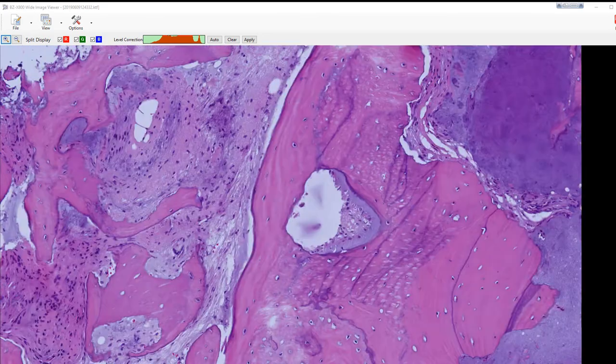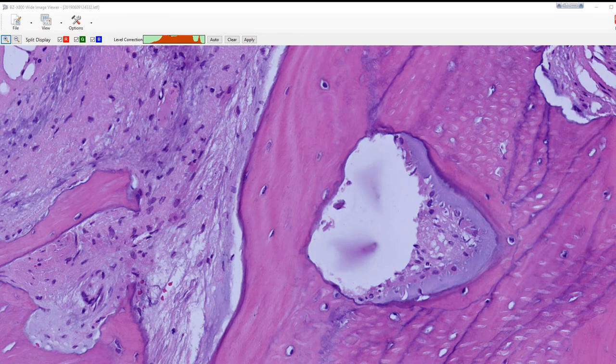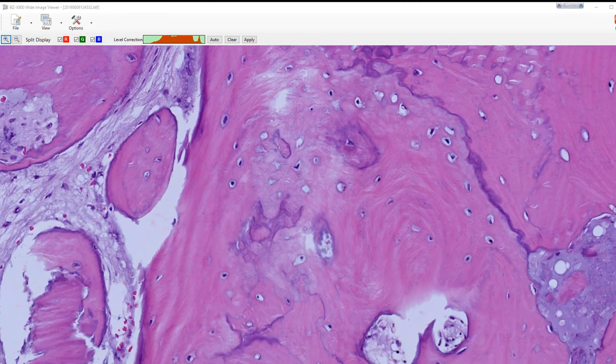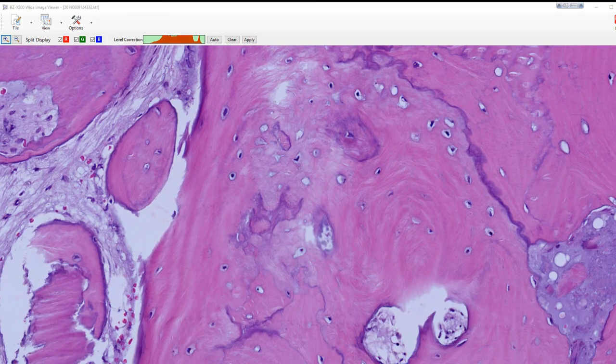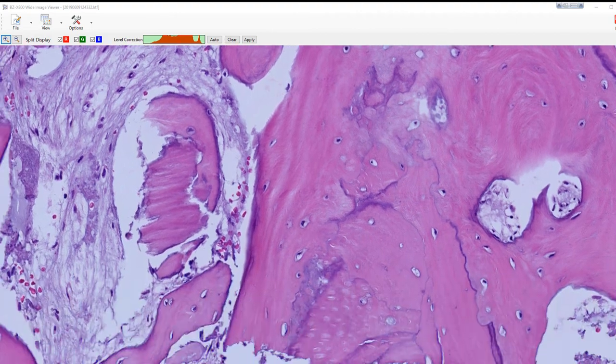For example, even zoomed in this much, it holds the detail together. And you can see so much more evaluating it this way.